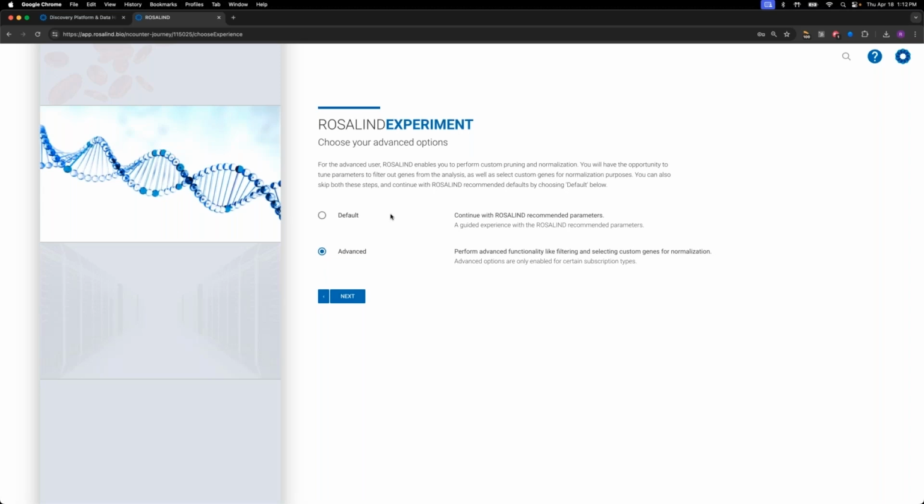And I think everyone's eyes are probably opening right now because obviously you don't want these low expression probes, you don't want this noise data to be involved in your normalization. First, you want to get rid of those and then perform your normalization. So that is why we switched the order. It was very deliberate. We put pruning before normalization so you can make sure you have very robust housekeeping genes prior to your normalization steps.